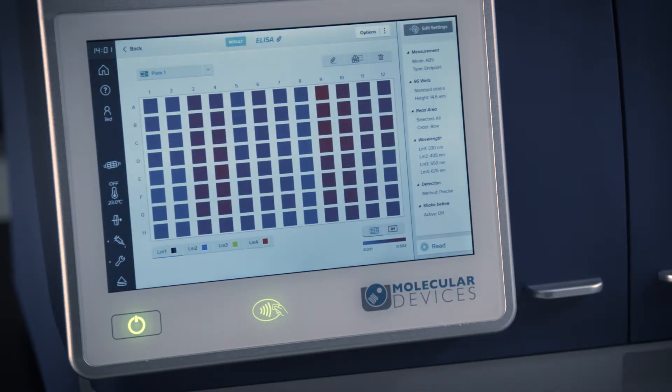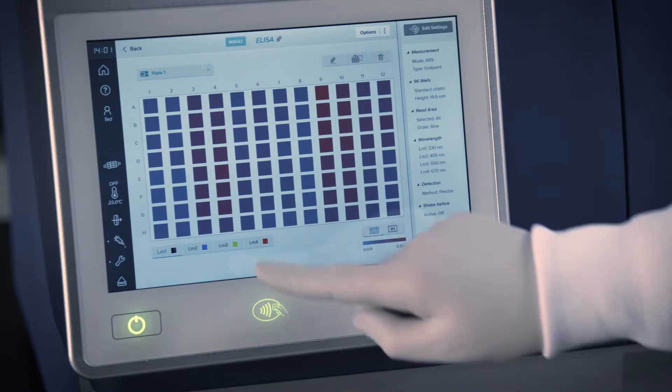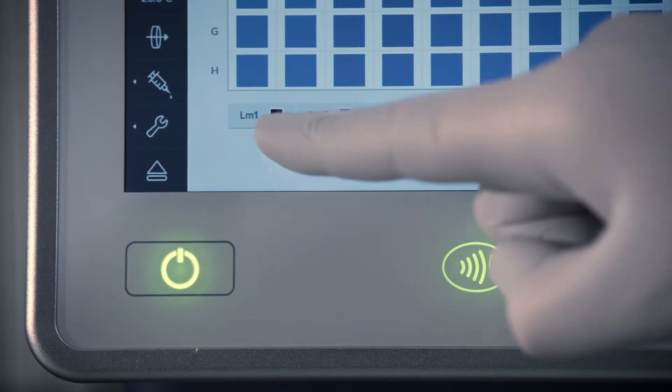If you've read more than one wavelength, you can toggle between multiple wavelength readings by selecting the appropriate lambda number at the bottom of the page.